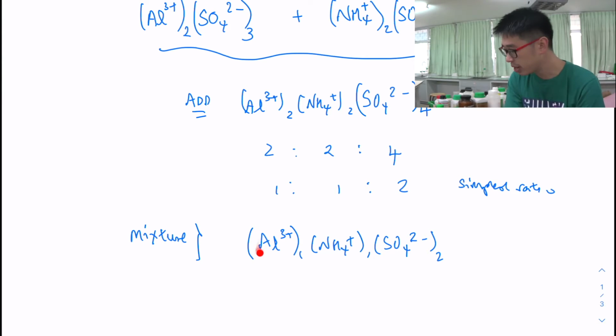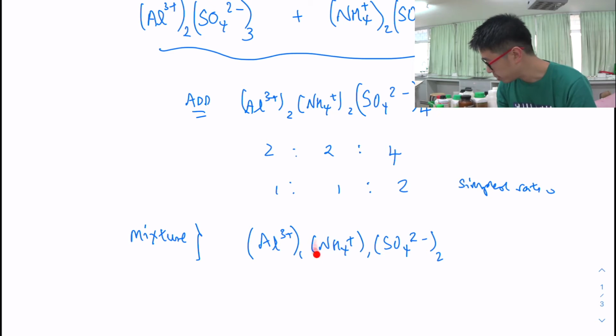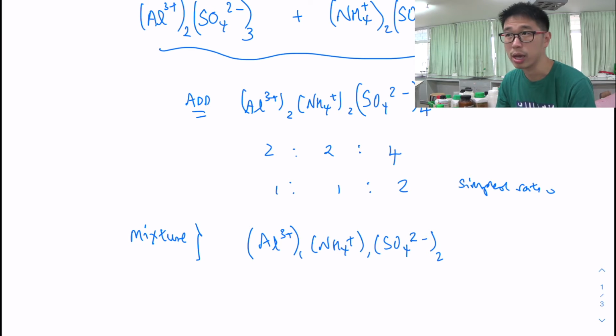They get simplified, and as you can see from the screen in the previous question, we had the simplification of this ammonium sulfate, and it was white in color because these are not transition metals at all. They are from the main group, right?